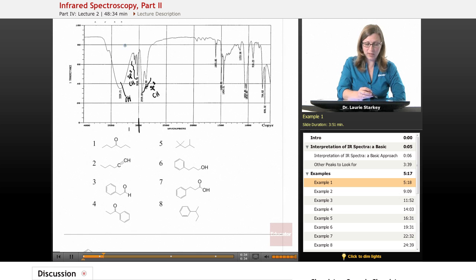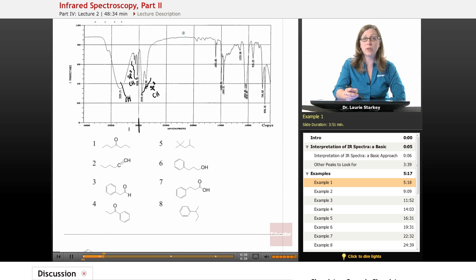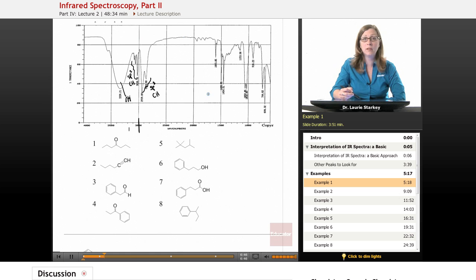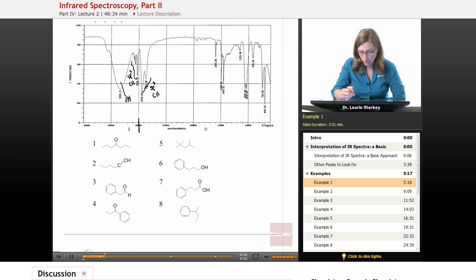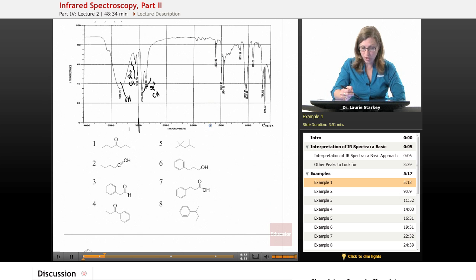We continue reading and go to 2200. We look for peaks there — do we have a triple bond? No triple bond. We continue to 1700 — is there a carbonyl? Could that tiny little peak be a carbonyl? No way. Remember, a carbonyl is the biggest, strongest peak in your whole spectrum. So there's no carbonyl and no triple bond.